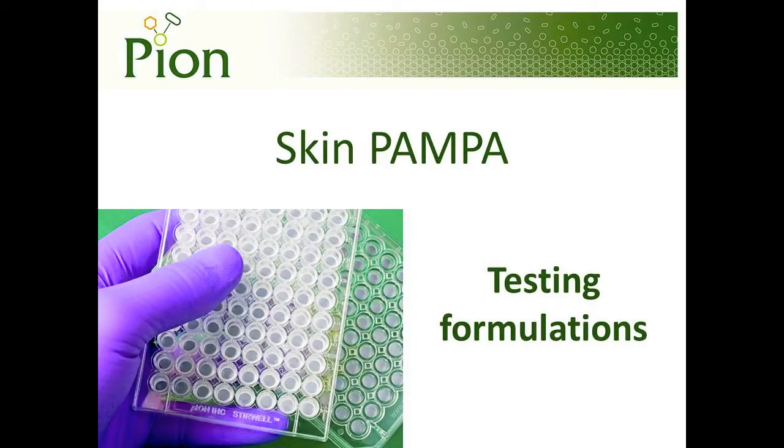Welcome! The following video demonstrates the usage of the SkinPampa skin penetration model system manufactured by Pion. This system serves as an excellent alternative to Franz diffusion cell method for topical formulation development.